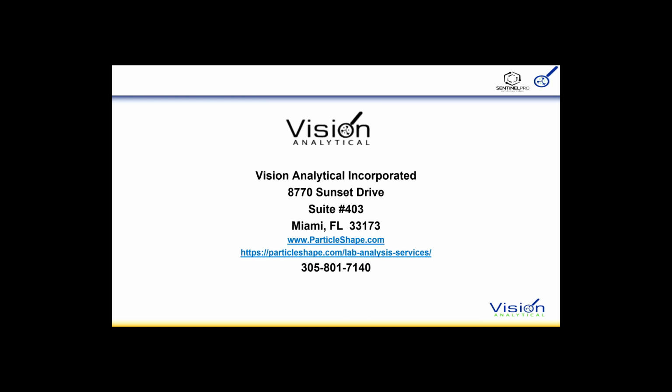If you can get your customer to send us 2 to 3 samples that perform differently in your process, we would try to identify those differences in our lab. If you could have your customer retain half of these same samples, then Vision Analytical can produce the same results we have done with the sample evaluations during installation and training. Perhaps then there will be no need to have a demo if the evaluation samples prove some viable features that are acceptable. Then the customer has less risk.